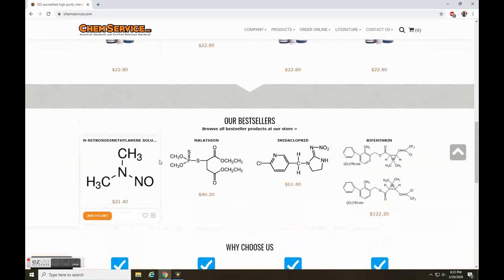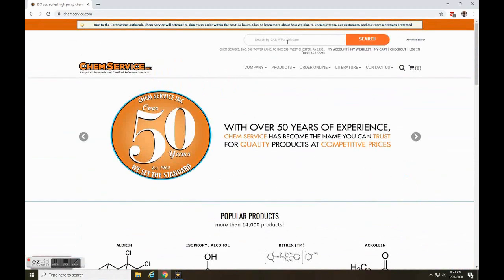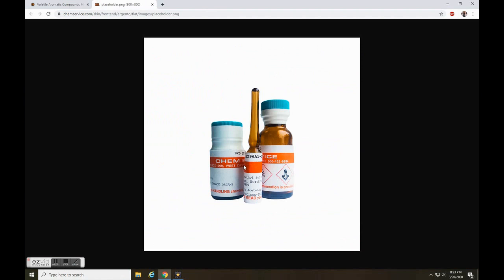In order to get valid quantitative analysis, I ordered three standards of one milliliter each for volatile analytes from Chem Service.